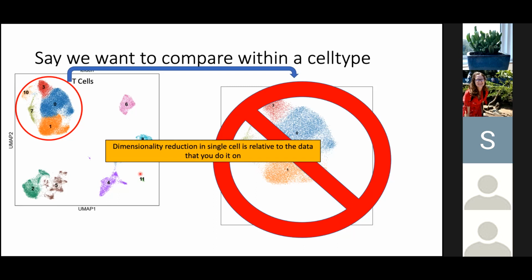I can tell you the way that I would do it, which is start with a very small resolution, and then do heat maps, and see where those heat maps start to look weird. It's going to start to look very weird after too many clusters. That's how I do it. I'm not saying that's the right way of doing it. Again, we covered the fact that heat maps are kind of hand wavy. I don't really know that there is an answer.